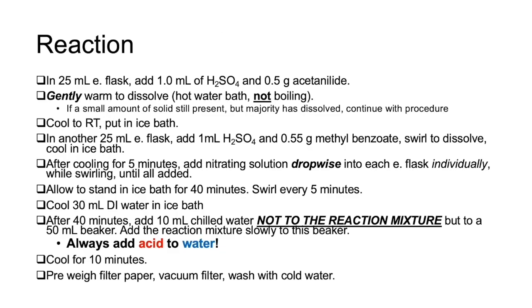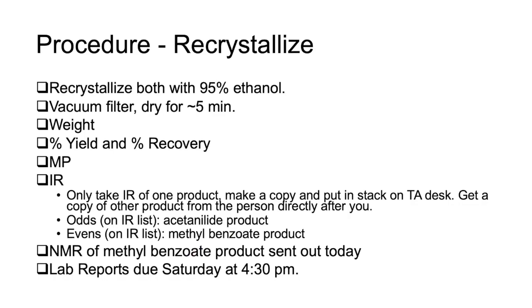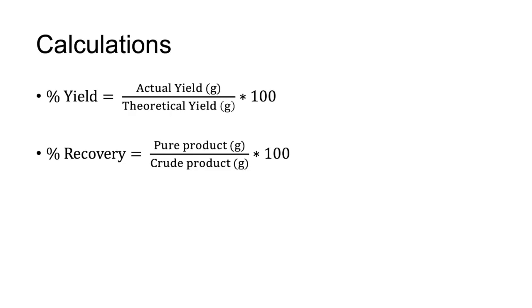As for the reaction, you can pause and read all of the steps, but what's really important is to always add acid to water and not water to acid. And these are the calculations you're going to have to do on your lab reports.